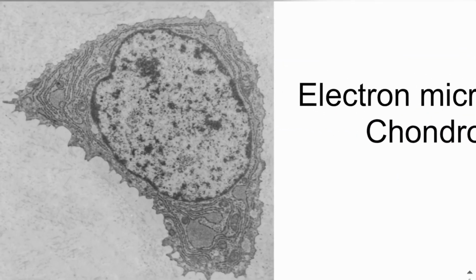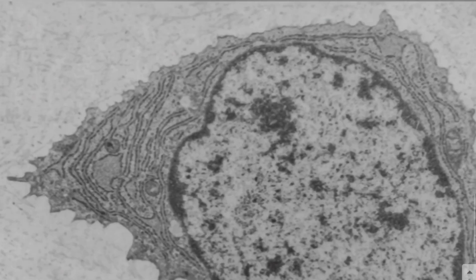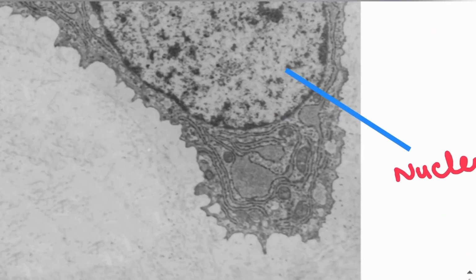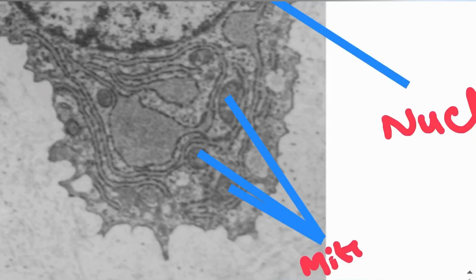So we can see that in the center we have a large nucleus. And what else can we see? We can see RER. So these are RER. How did I recognize that this is RER? Again, you can see dots above the sacs. What else can we see? We can see these particles which are sausage-like and spherical. These are mitochondria, right?